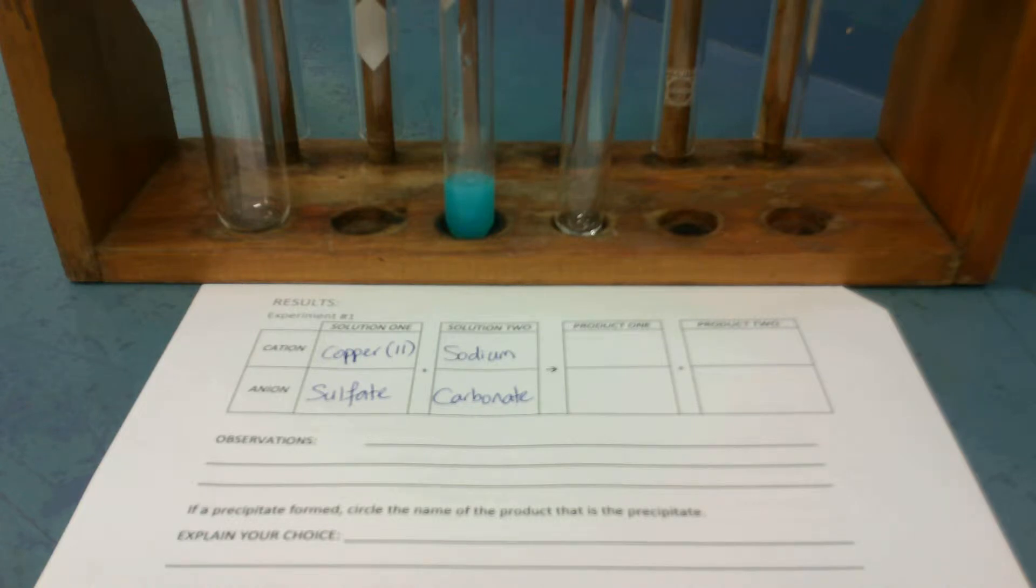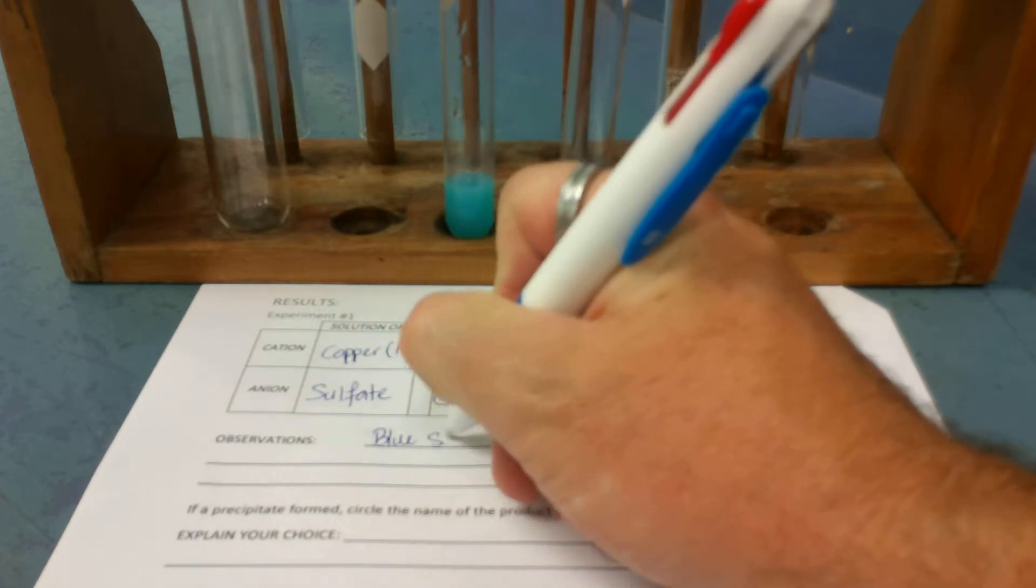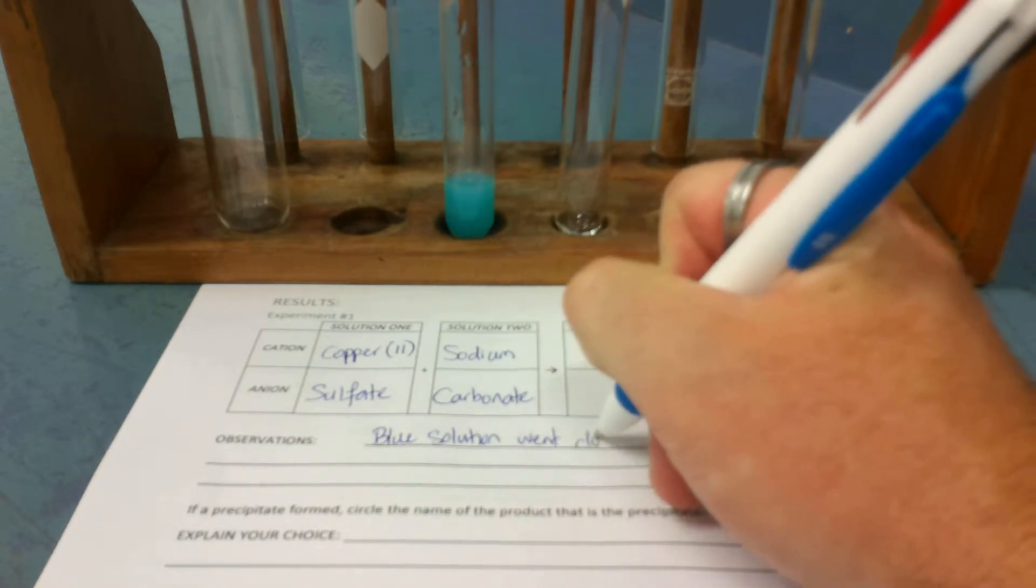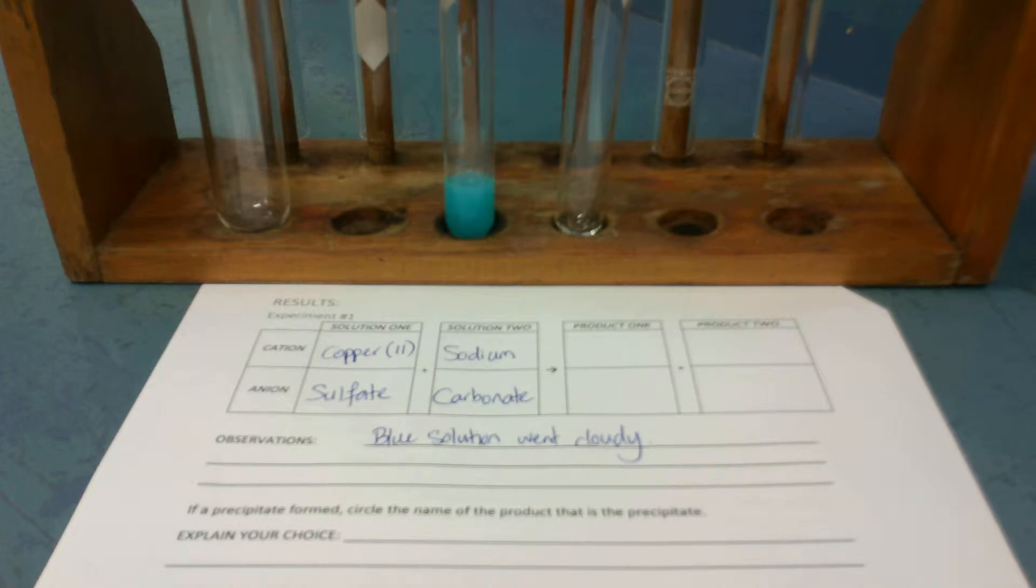So the observation is that we've got a blue solution. So the blue solution turned into a blue precipitate, or a blue solid, or went cloudy. So blue solution went cloudy. That's enough. I know I've given you three lines, but that's enough for an observation.